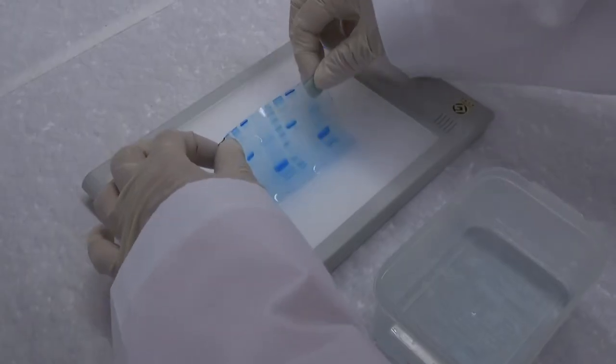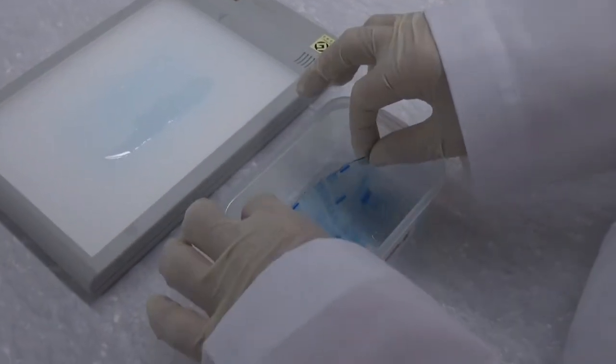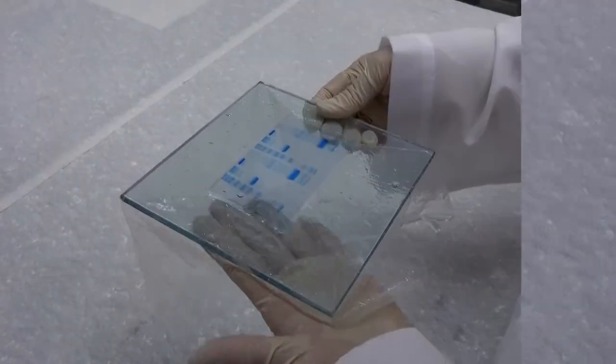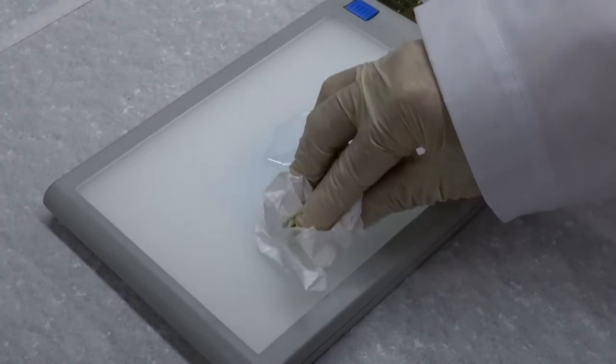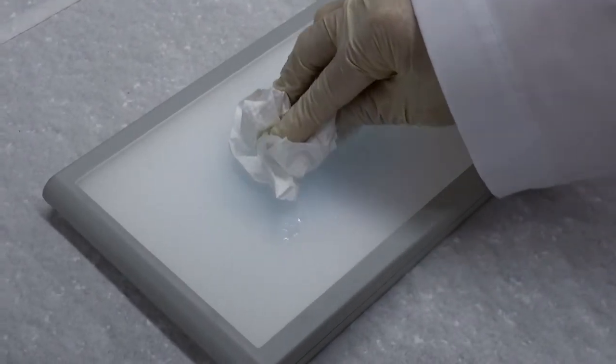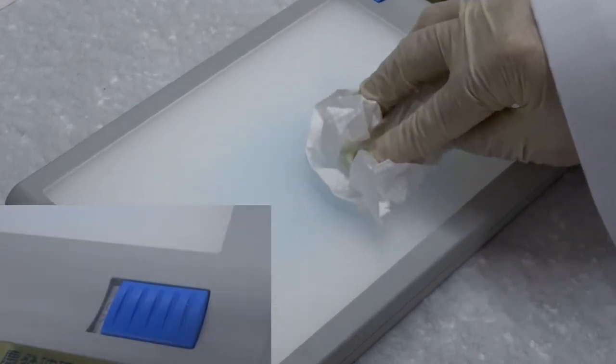After taking the pictures, carefully move the gel back to a container, or seal the gel in clear food wrap for storage. Remember to wipe away residual liquid from the light box and turn off the power.